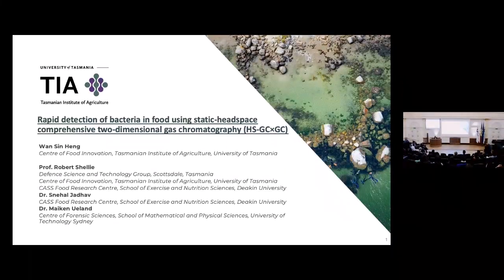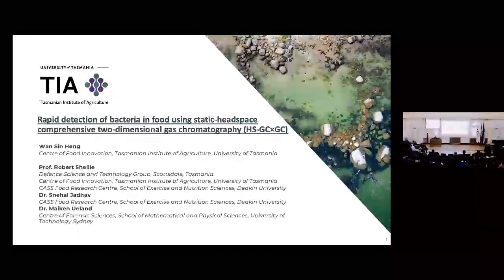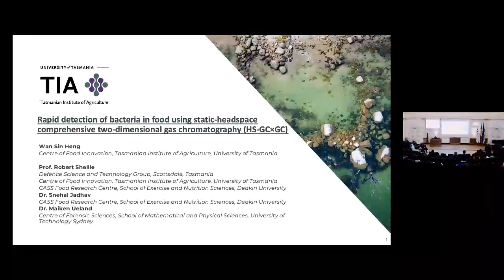So today I would like to share a topic from my PhD, which looks into developing a rapid technique for bacterial detection in foods by using static headspace GC×GC.